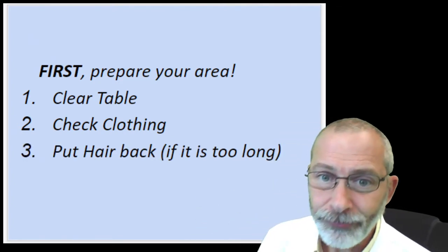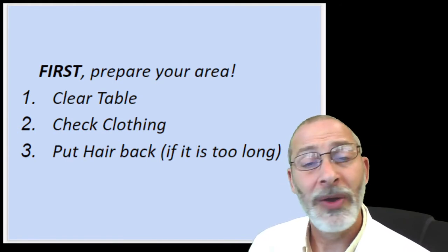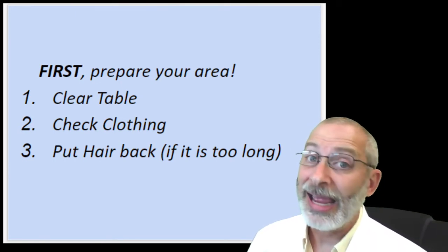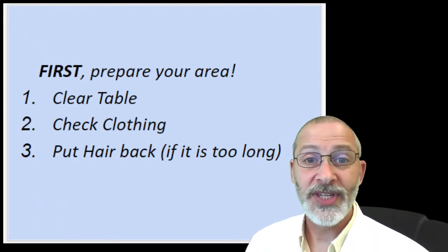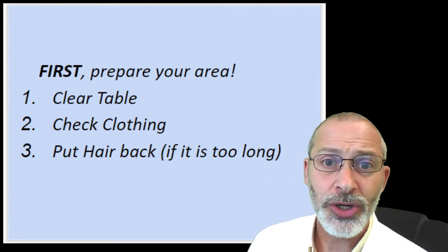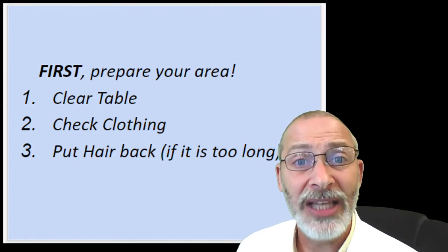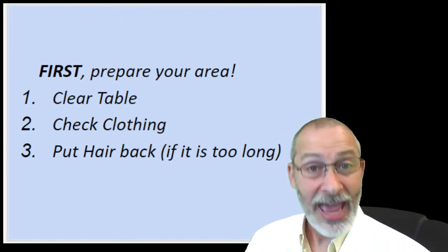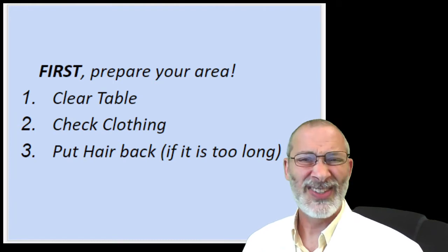Next, if your hair is long, I'm not going to ask you to cut your hair off. No, no, no, no. But I am going to ask you to put your hair back. For the same reason as strings and hoods on sweatshirts, long hair is a safety hazard in the laboratory when we're working with chemicals and with flames. Hair can ignite just as easily as a hoodie can ignite. And it stinks really bad.